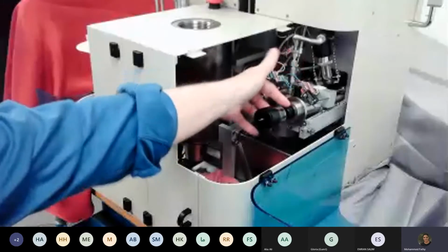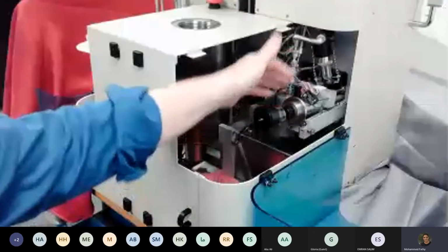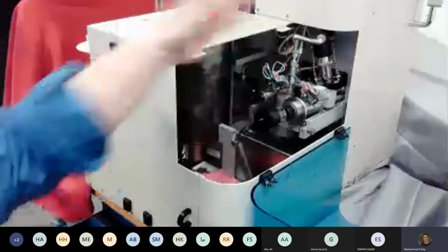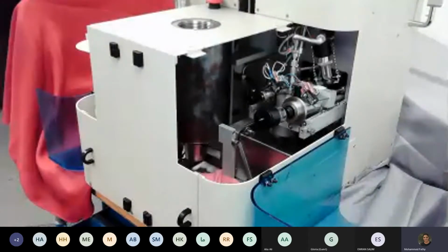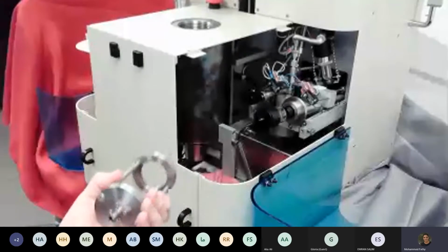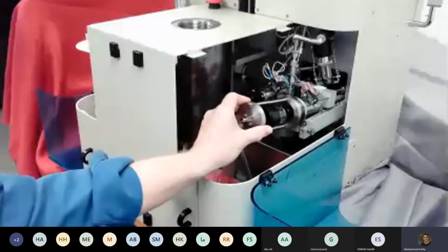There's an O-ring seal here, and it's this O-ring seal that seals the penetrometer into the instrument. And then I'm going to put on the rest of the retaining system and makes electrical contact. So we're just going to put that on there. Just have to step up here so I can see exactly what I'm doing. And then this is going to be screwed into place here.